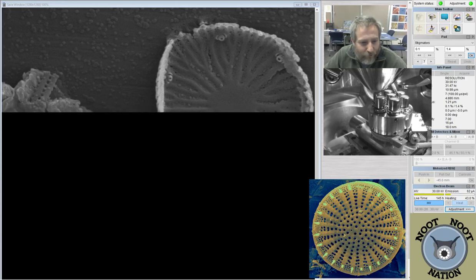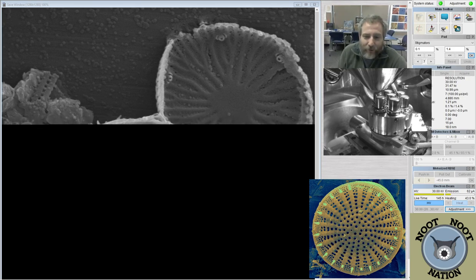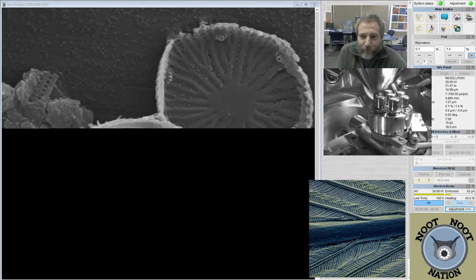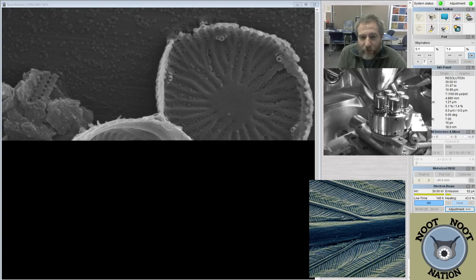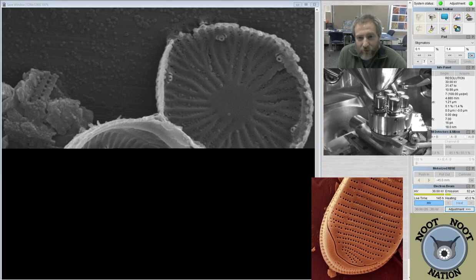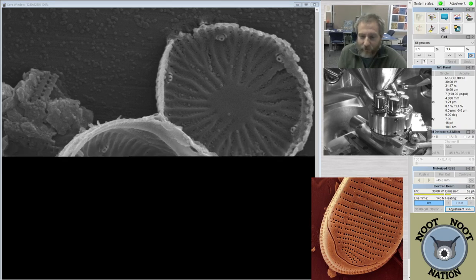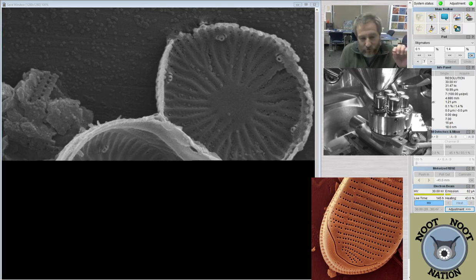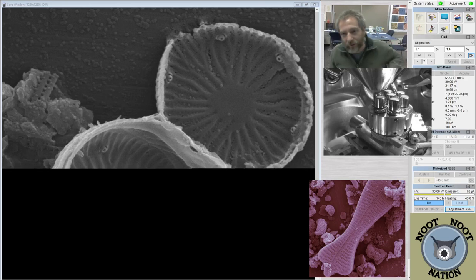Being a diatom seems pretty chill and an easy kind of life. Yeah, I would say pragmatic, that's probably true. Diatoms are pretty laid back in general. They do a lot of floating, sucking up nutrients, and hanging out in the sunlight where they can get food. And then they do a lot of replicating, so a lot of cloning themselves, and then floating for these guys. But the other ones kind of crawl around or attach themselves to a substrate. It's pretty chill. I would say they're just kind of sitting there.